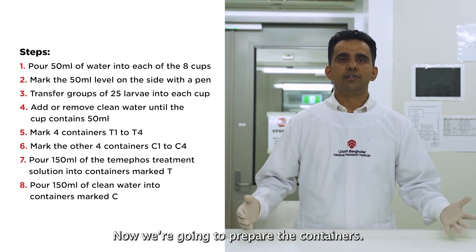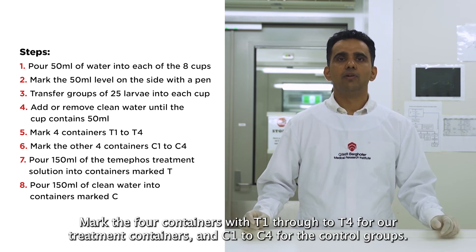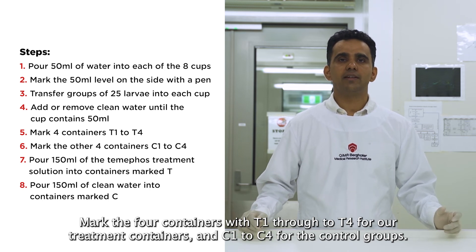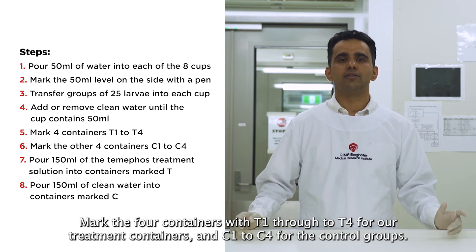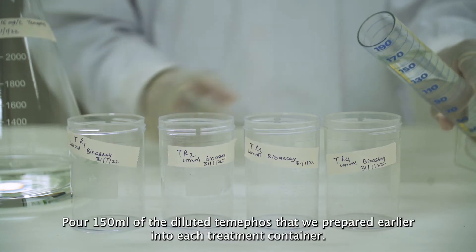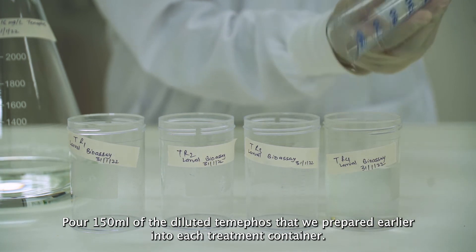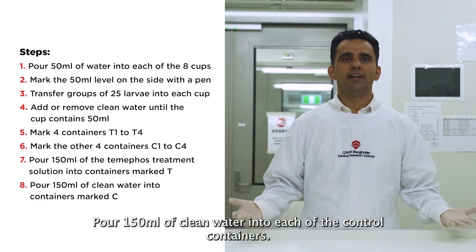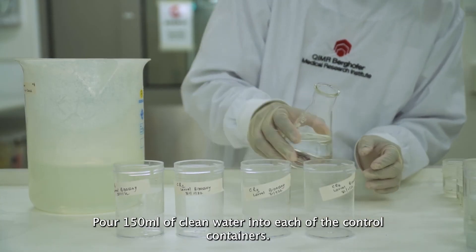Now we are going to prepare the containers. Mark the four containers with T1 through to T4 for our treatment containers and C1 to C4 for the control groups. Pour 150 ml of the diluted Temephos that we prepared earlier into each treatment container. Pour 150 ml of clean water into each of the control containers.